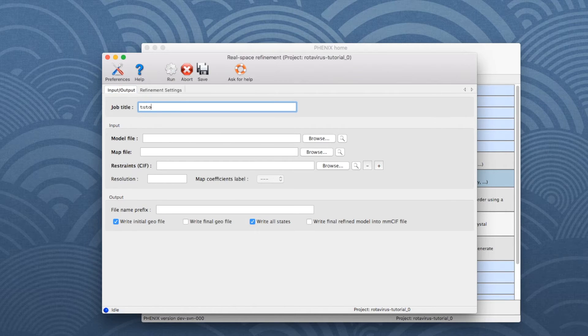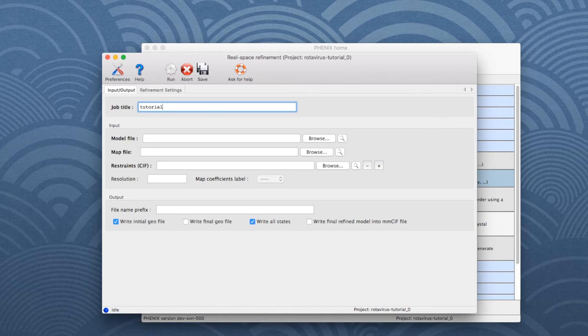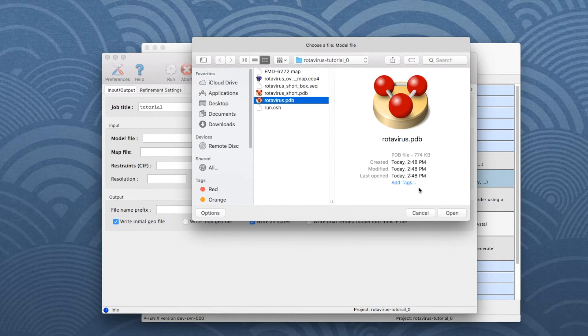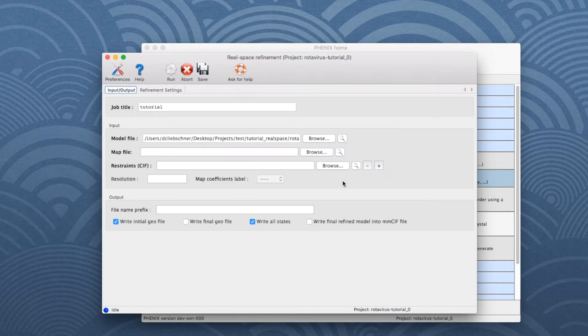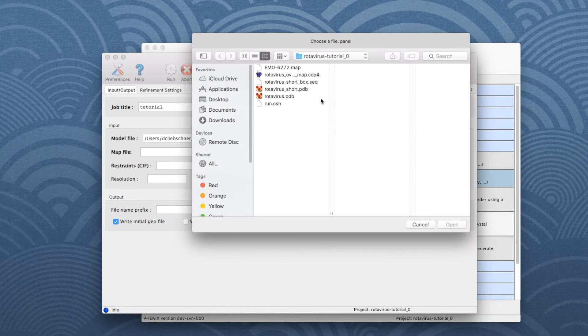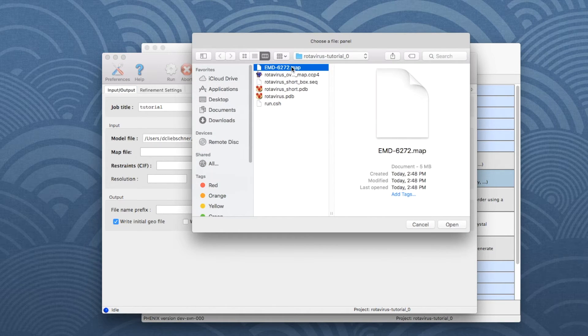For bookkeeping, let's first add a job title. Next to Model File, click Browse and select the file Rotavirus.pdb from the dialog window. Then add the map from the list of available files.